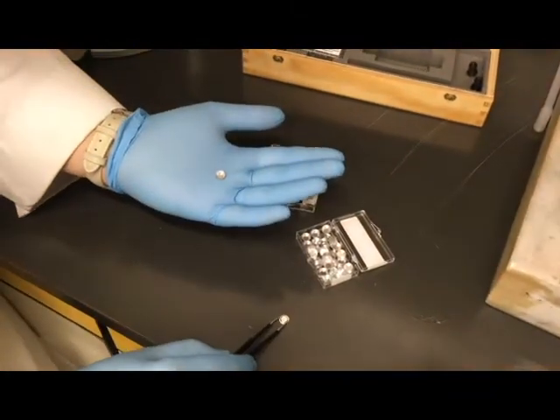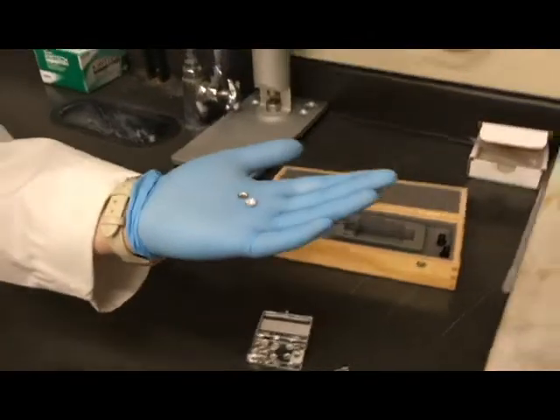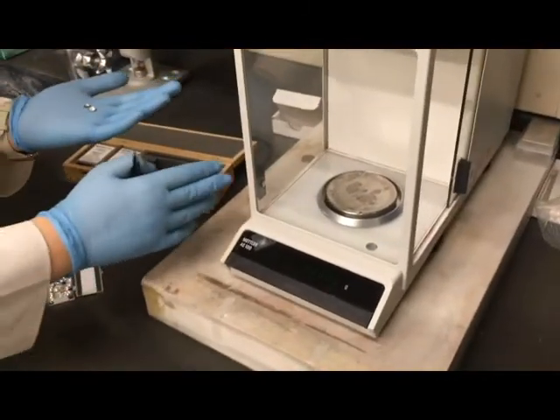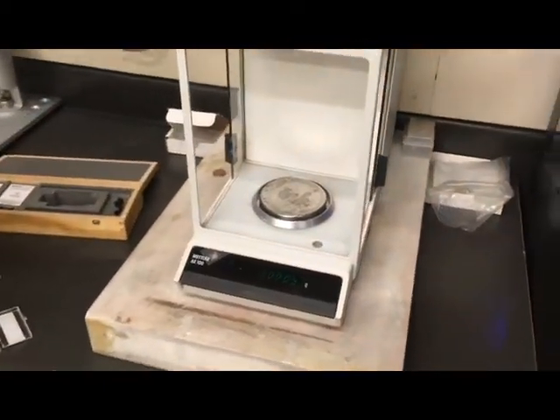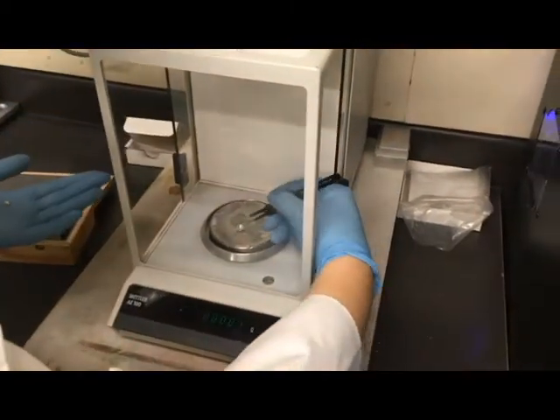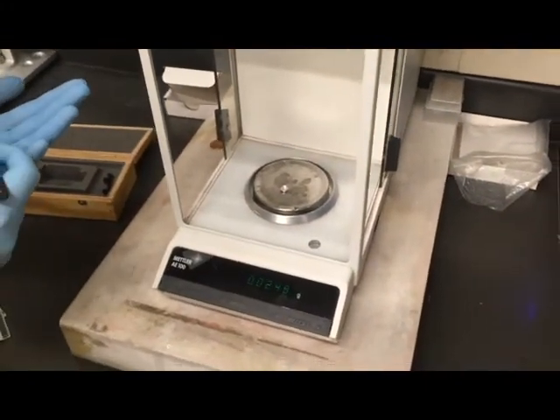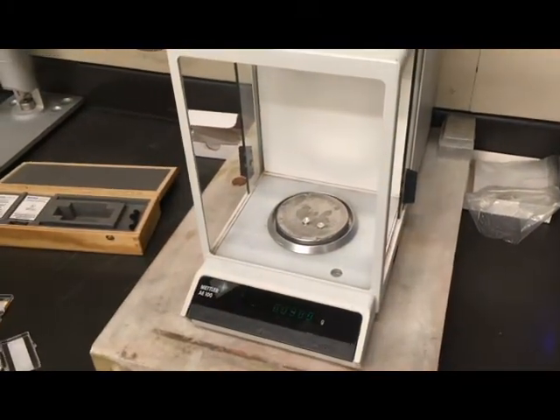We are going to weigh our crucible so that we get an empty weight. Most of these crucibles weigh approximately 39 to 40 milligrams.